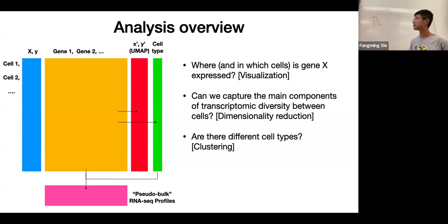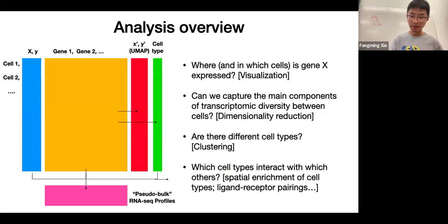For one thing, you reduce this error if you aggregate a lot of cells together. You will see that. For another, you have full control of which group of cells you want to bulk together. So that's much better than the traditional way of doing it, where you have no control, no way to know whether the things you're grouping together are different or not.